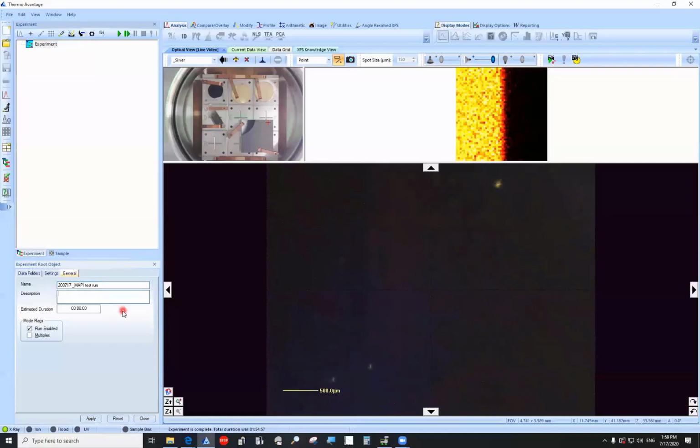Down here, you can put your sample name, Z123, whatever it happens to be. You can annotate this as you see fit. And essentially, you're defining where all the stuff is going to save. What we're ultimately going to end up with here is an experiment that you can utilize over and over again. The only thing you'll need to update are the actual positions you want to scan. So we've added the experiment, and we've saved a location where it's going to dump all our data.